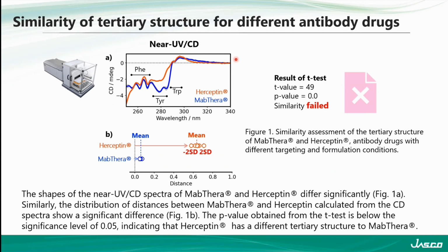If you've done CD before, you have a handle on the types of differences you'd expect from 2 spectra. But let's say that you're a new user. If you run these 2 samples, it might not be clear to you whether this type of difference is statistically relevant, right? If we've never run CD before, the question is, well, this could be just noise, or maybe I'm doing the technique wrong.